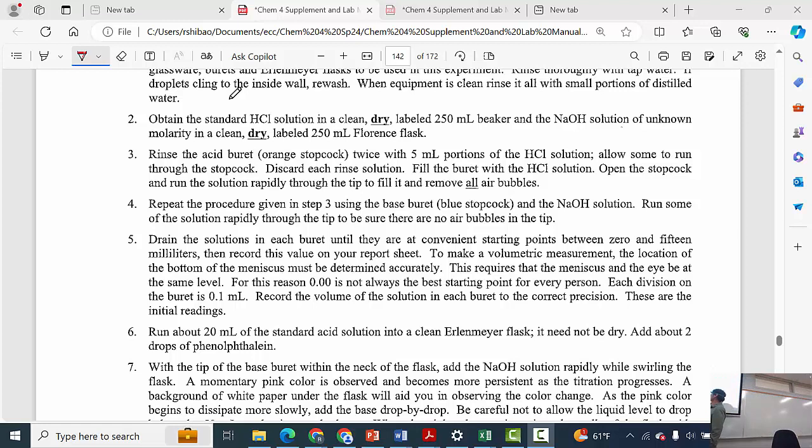Now, do you see much color? I see the purple from the LED, but do you see much color here? No. All right, now I'm going to get this within a half drop. My burette's still leaking. Do you see a half drop is hanging there? I need to get a new O-ring for this. What I'm going to do is just wash that half drop in here. Oops. I hit it out.